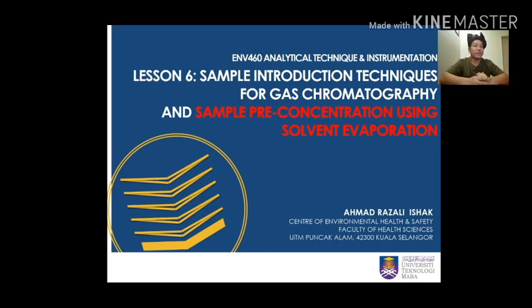So today we will proceed to lesson 6, sample introduction technique for gas chromatography and sample pre-concentration using solvent evaporation. This lesson is divided into two sections. The first one will cover the sample introduction techniques and the latter cover the type of solvent evaporation method.